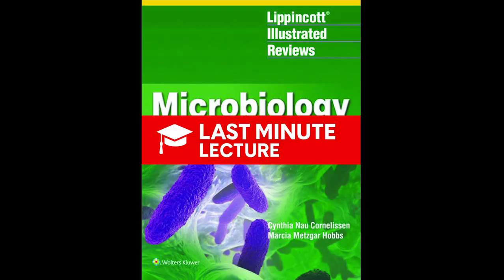How do we get the final name? Now we do biochemical profiling. We look at their metabolic fingerprint by testing for specific enzymes. The book lists some quick ones, the catalase test. Oh yeah, you drop some hydrogen peroxide on the colony. If it bubbles, it's catalase positive. That's the test that separates staph, which bubbles, from strep, which doesn't. Bubbles mean staph. Easy. What about coagulase? That's the specific test for Staphylococcus aureus. It's the only major staph species that makes an enzyme that clots plasma. If your tube of plasma turns to a gel, you've found Staph aureus.